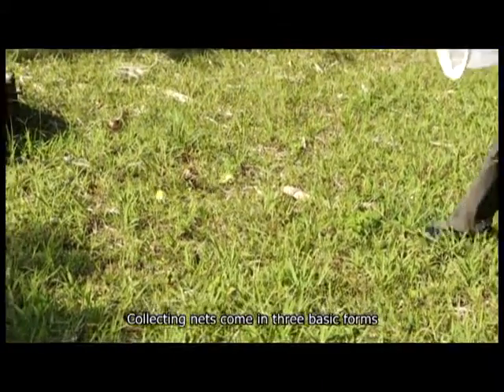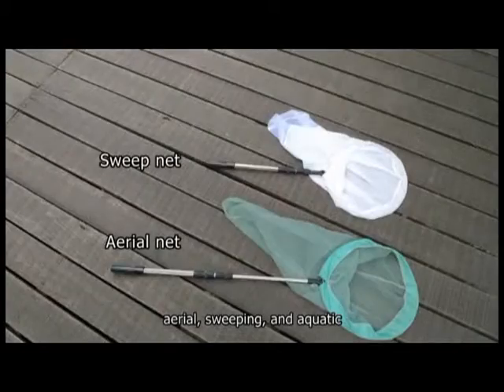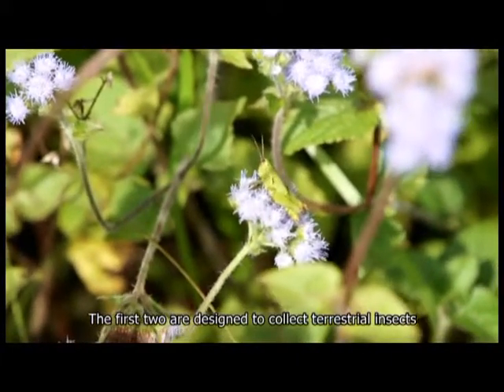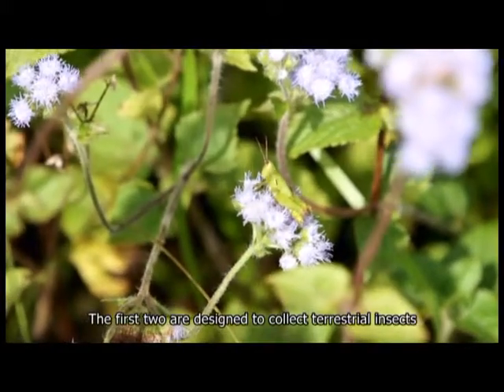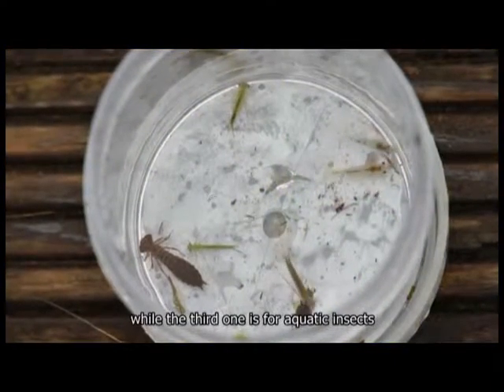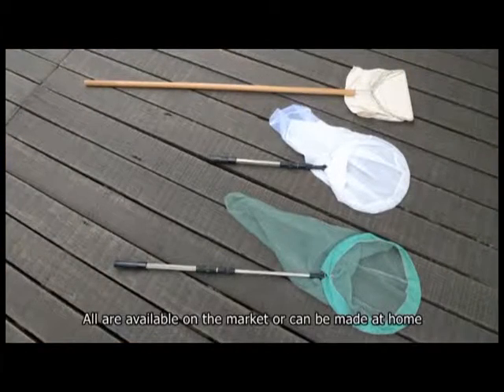Collecting with an insect net: collecting nets come in three basic forms — aerial, sweeping, and aquatic. The first two are designed to collect terrestrial insects, while the third is for aquatic insects. All are available on the market or can be made at home.